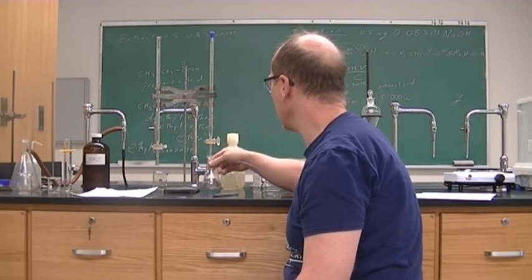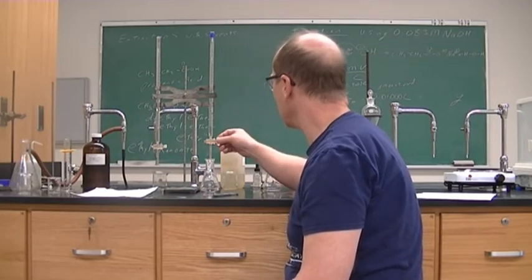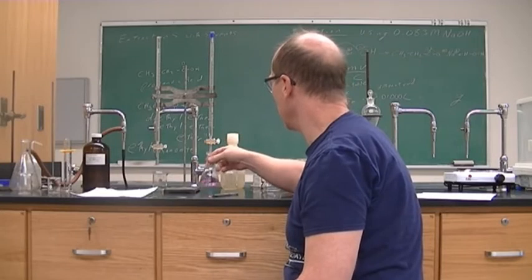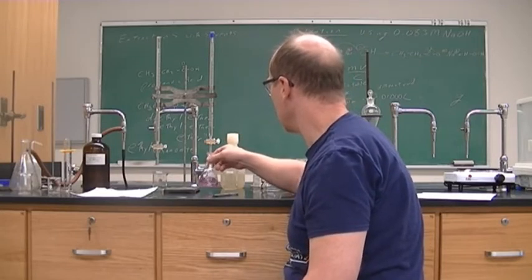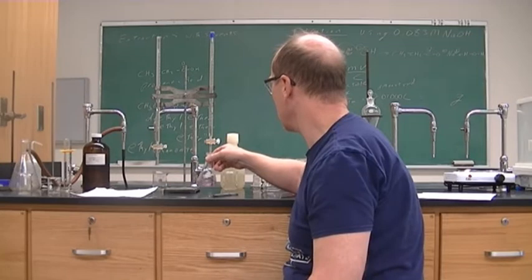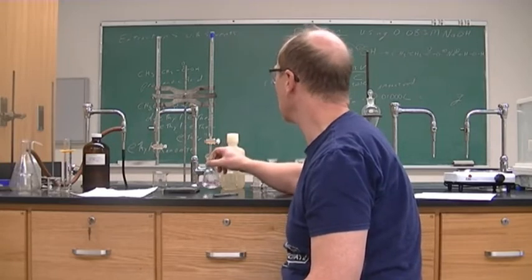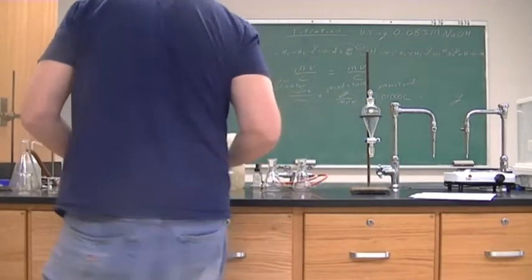Very close to the end point. All right, that should do it. Let's see if this stays. All right. So it's still a light pink, and so that is our endpoint.